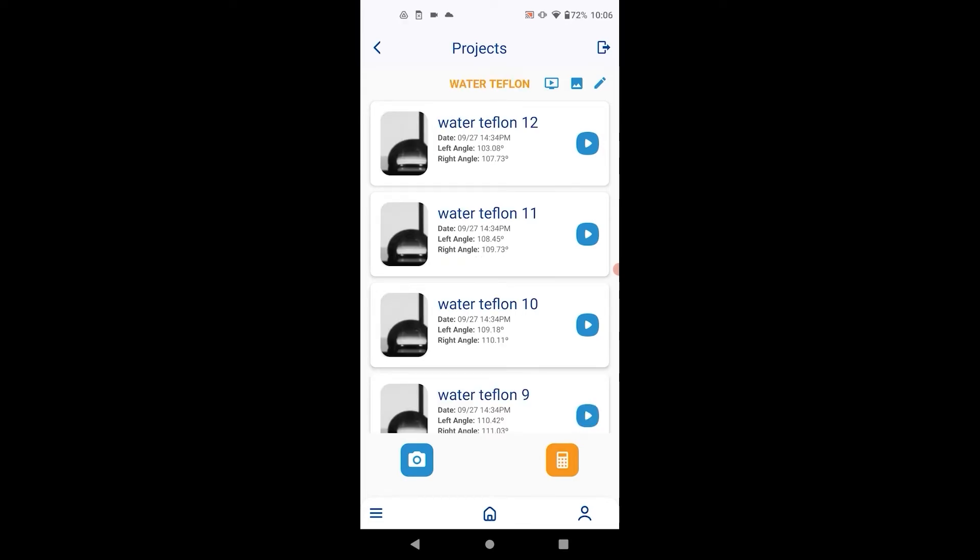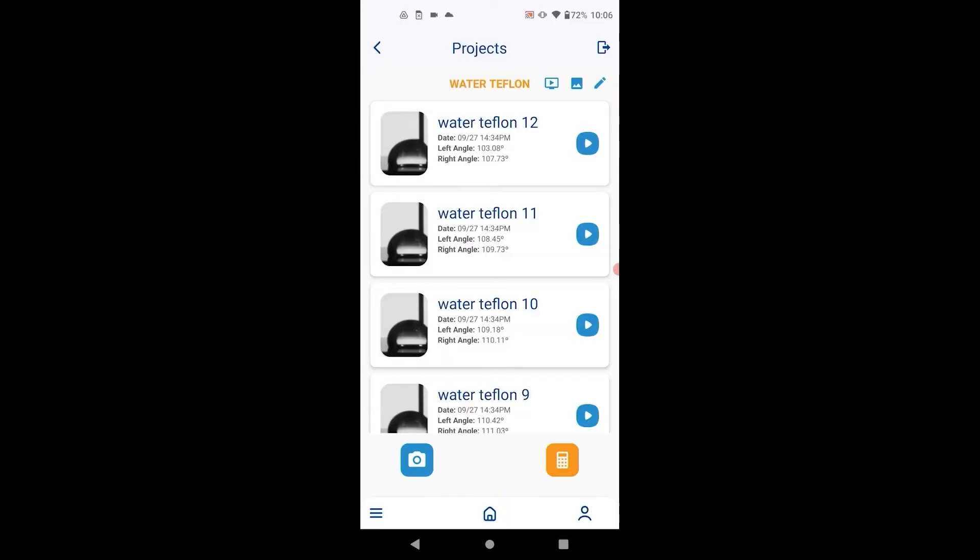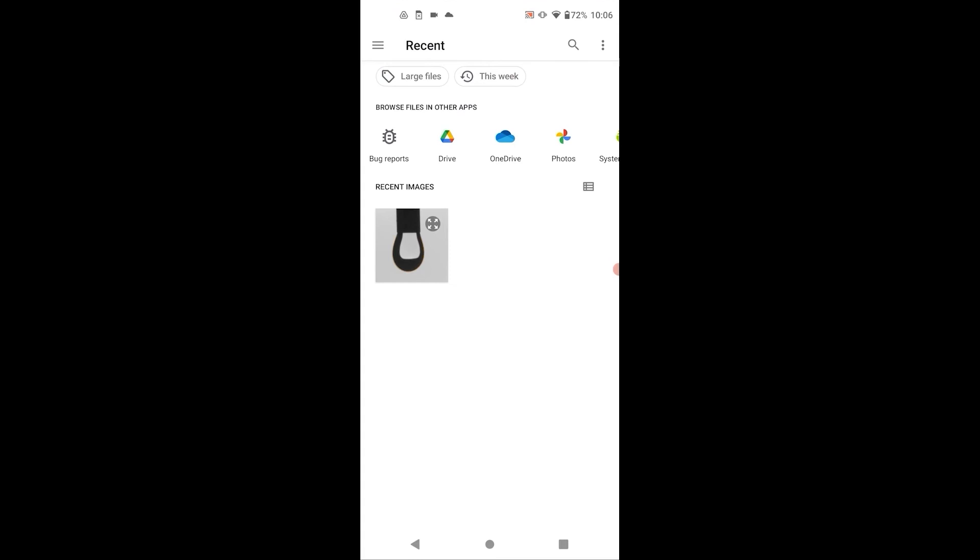A few features that are accessed from the project screen. The project parameters can be edited. You can load external images into the project.